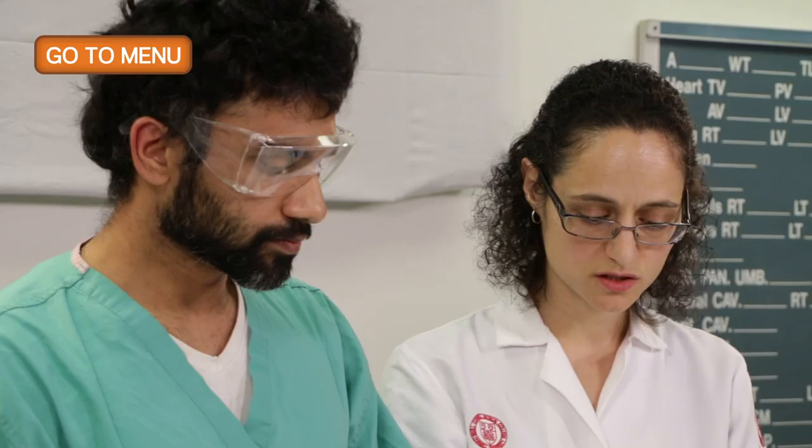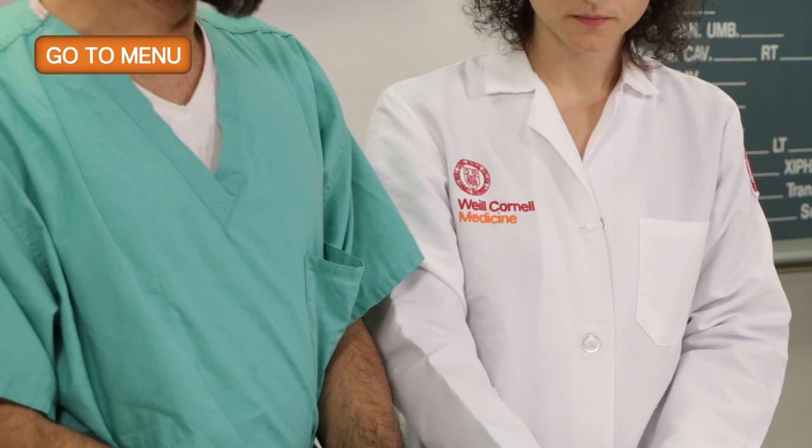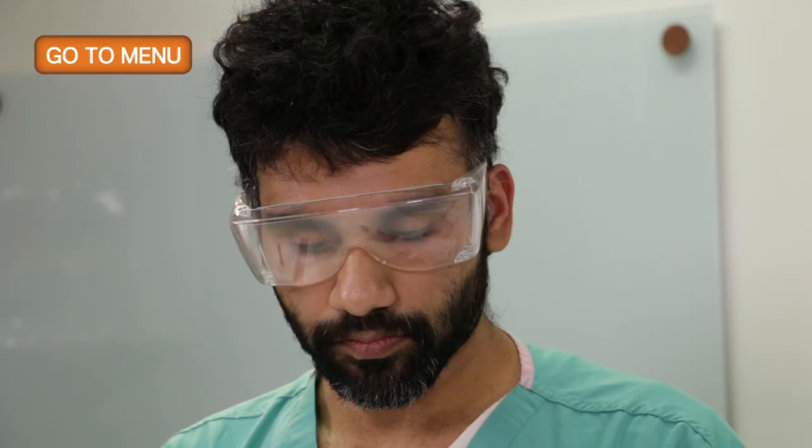Nodules are relatively common in thyroid. Most of them are benign, but some of them get large and cause compressive symptoms, or some of them are cancer and have to be removed. If there are fine needle aspiration findings that are indeterminate, they also usually will be removed, in which case you do what's called a diagnostic lobectomy or hemithyroidectomy.